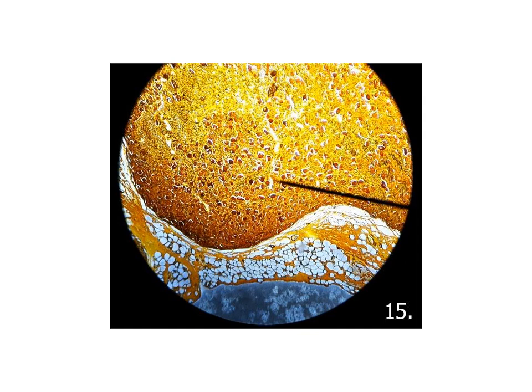This slide also is characterized by the brown coloration, so it is of the group of the characteristic color, not nerve trunk with osmic, not ground compact bone. It is either the spinal or the sympathetic ganglion. You can differentiate between them by looking at the arrangement of the cells. As you see, the cells here are scattered, and they are almost all of the same size. They are all small cells scattered in the section.